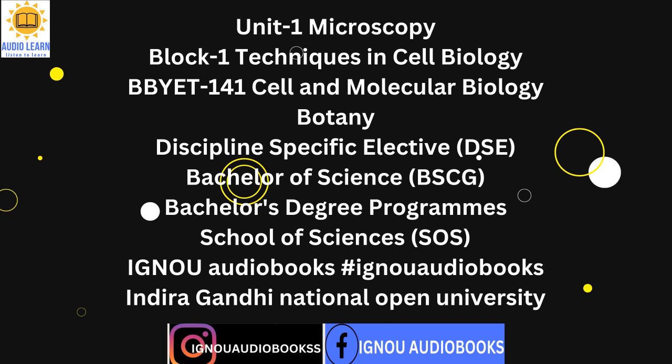Specialized optical microscopes. Modifications and a range of special adaptations have been made in the basic optical microscope. In some specialized microscopes, the illuminator and lens systems are incorporated into a single unit. Inverted microscope. The light source and condenser are situated in the upper part of the microscope and direct light down to the stage.